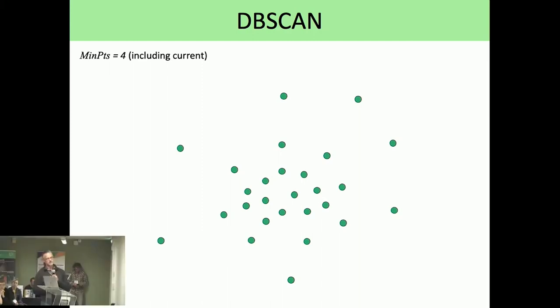So let's say that we define the distance, which can be something close to the resolution, for example, so you can fix the radius of search for your molecules. And that's one of the limits of the technique: you have two parameters that you can set to define the density. One is to fix a threshold on the minimum number of localizations to define a cluster.